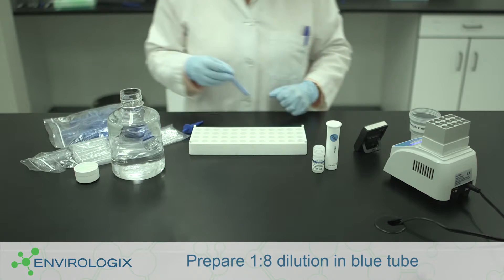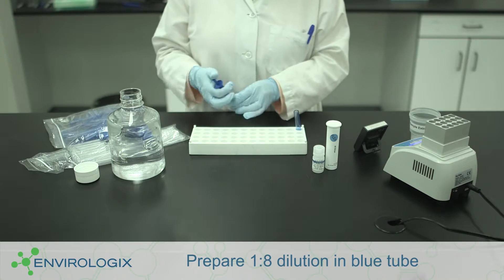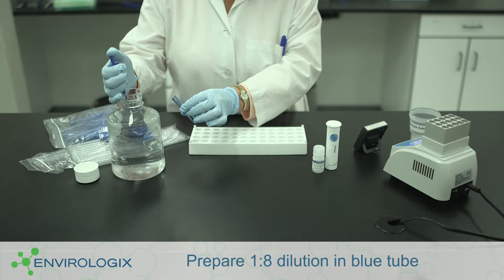In a blue dilution tube, combine clarified extract with water to create a 1 to 8 dilution. For example, 100 microliters of clarified extract plus 700 microliters of water. Measure carefully and mix well.